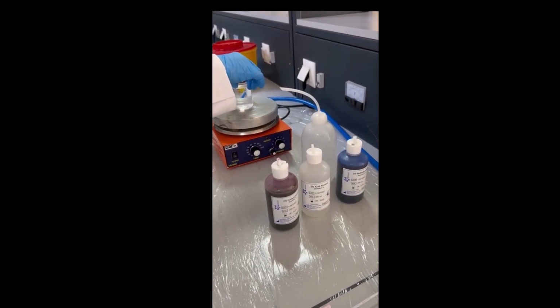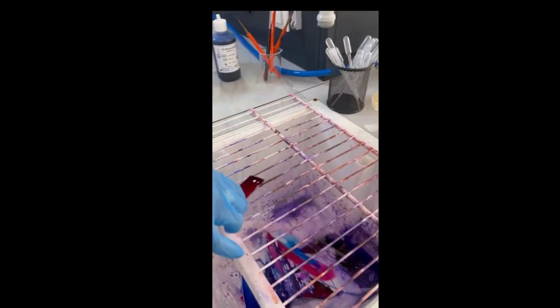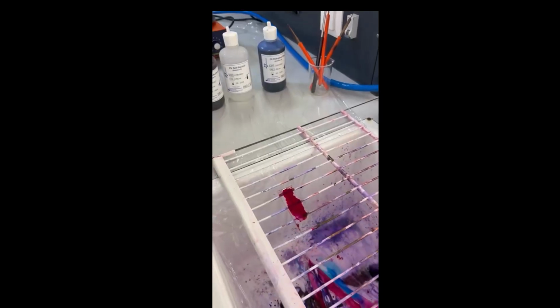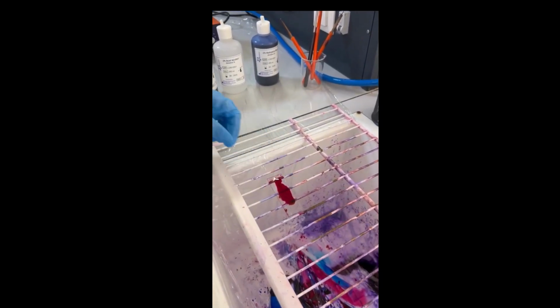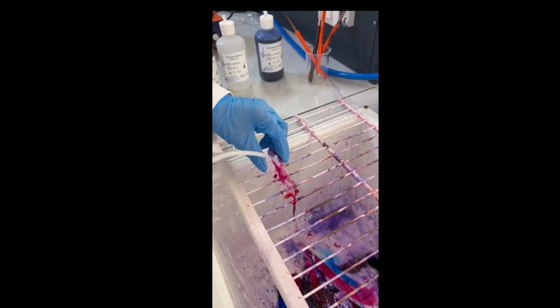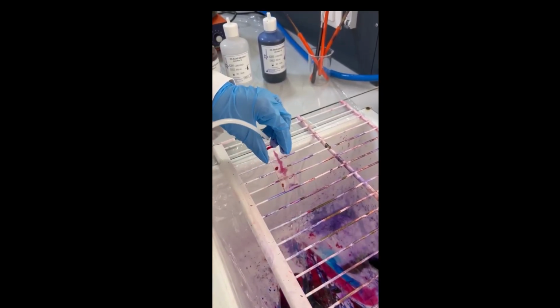After 5 minutes, remove the stain and allow it to cool. Then you will wash the slides until the color disappears.